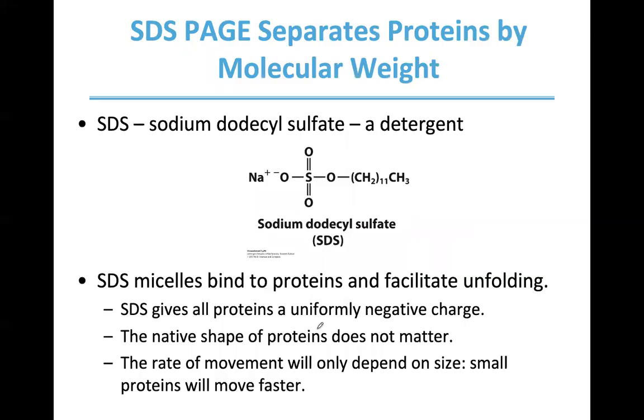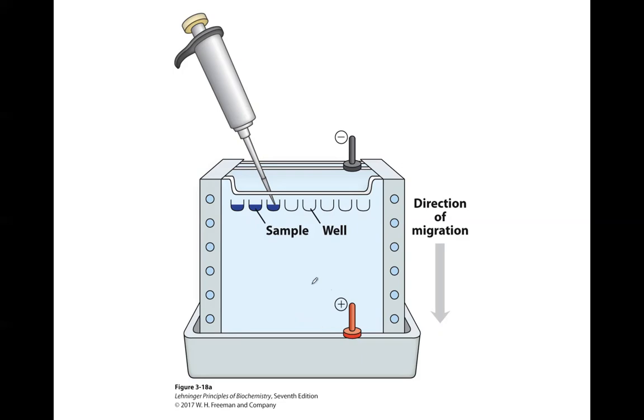And what you may wonder, so the migration depends on the size of the proteins, right? But it also depends on the shape. So even though one protein may be smaller than another protein, it may be more branched. Let's say it's like going into a jungle with your arms spread out. Even though you may be a small person, you may have a hard time getting through all these branches. But a big person will put his arms like that, turn into a potato, and will be able to get through the branches very easily, even though the person is much bigger.